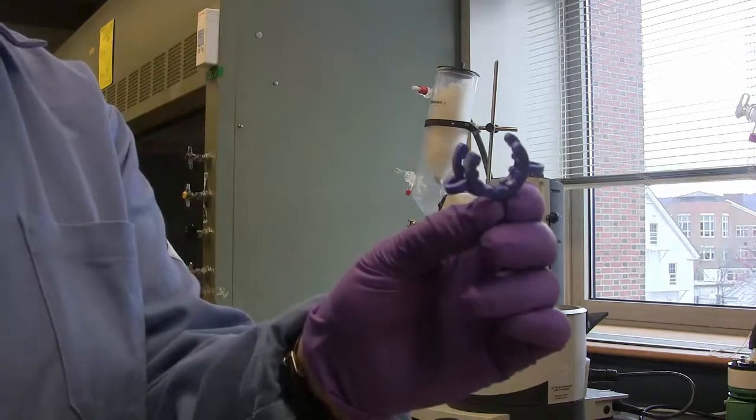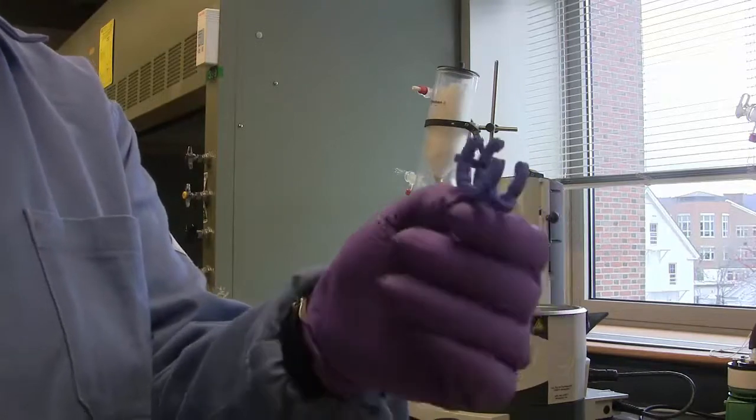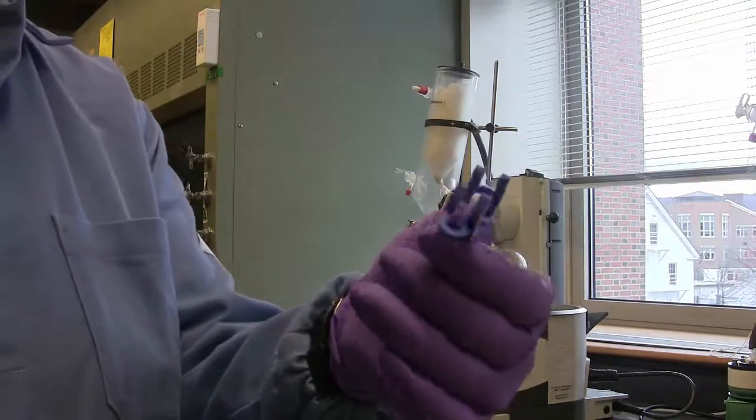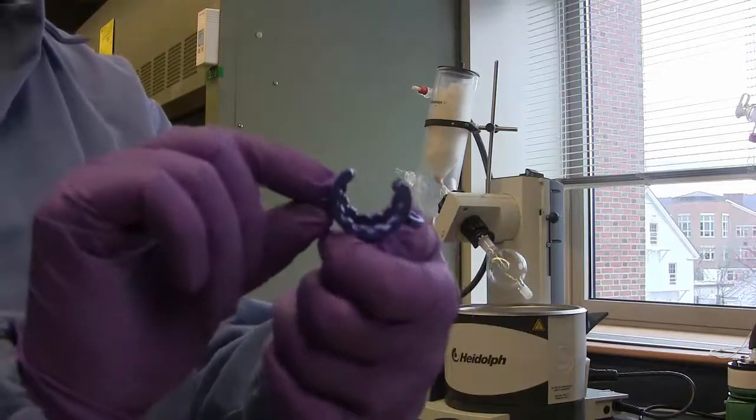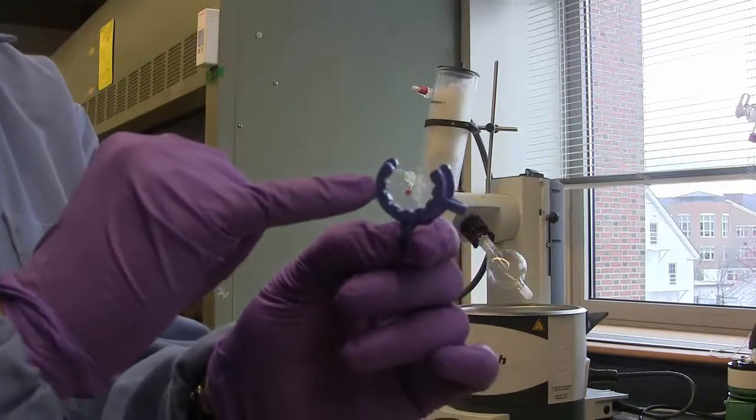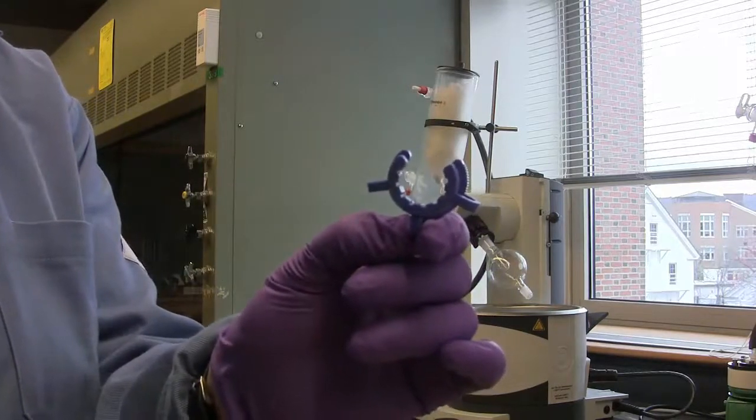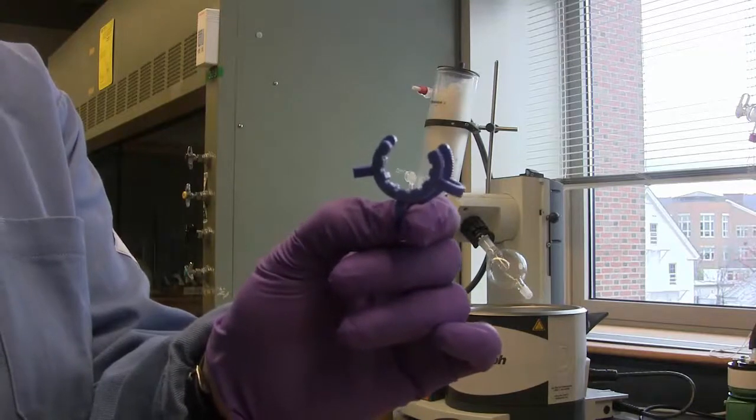Another important feature of the rotary evaporator is the use of a Keck clip. This is simply a plastic clip, and you'll notice that one side is a little bit larger than the other. The small side, facing the camera now, should be clipped onto the bump guard, or the male joint, when connecting ground glass joint wear.